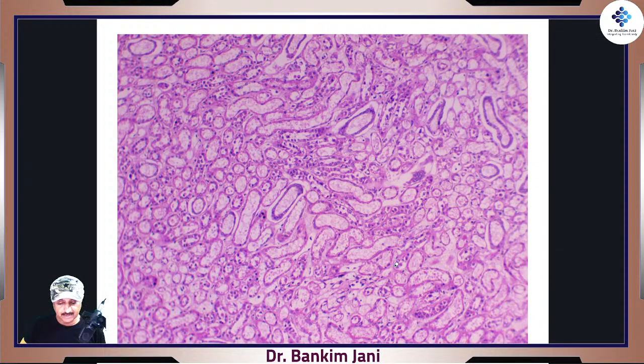See, these are collecting ducts, because they open like this. This one, and then over here there'll be another collecting duct. Over here another nephron is opening, and then this duct is getting connected with another one, and the section goes like this. So if there are others here, there will be this section. That way multiple collecting tubules are cut, and that's what we are watching now.